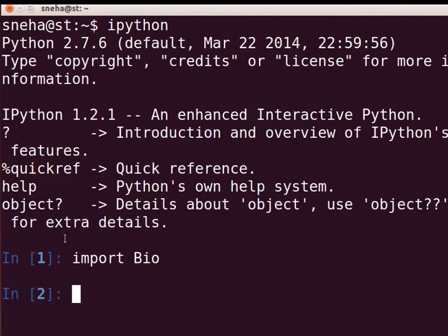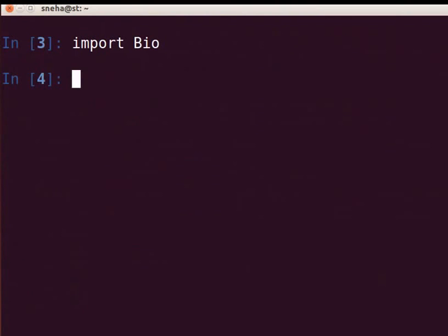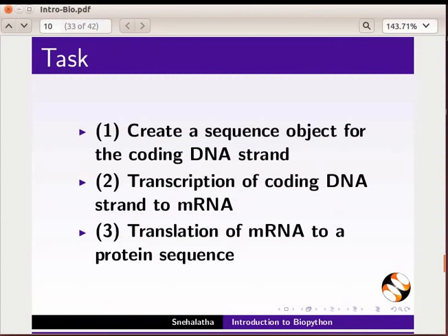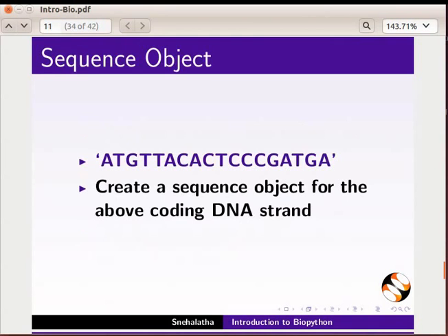For instance, in the import statement, 'i' in import is lowercase and 'B' is uppercase in Bio. In this tutorial, we will use BioPython modules to translate a DNA sequence. The steps involved are: first, create a sequence object for the coding DNA strand; next, transcription of the coding DNA strand to mRNA; and finally, translation of mRNA to a protein sequence. We will be using the coding DNA strand shown on this slide as an example, which codes for a small protein sequence.